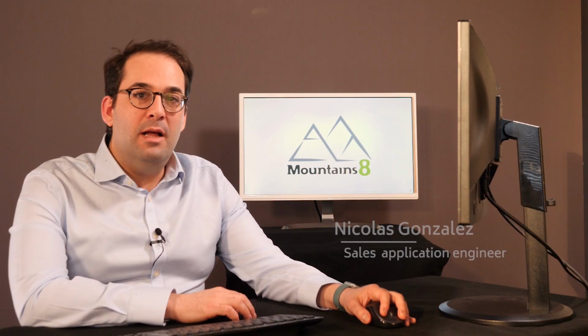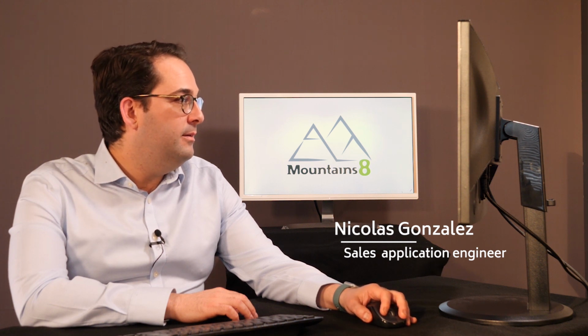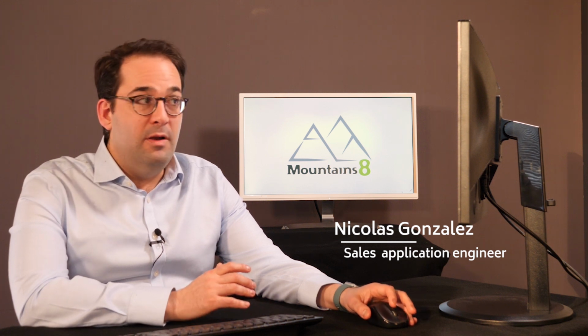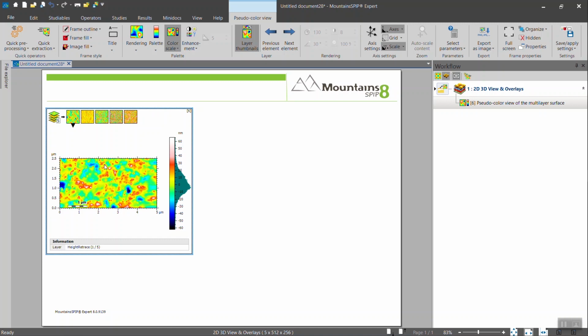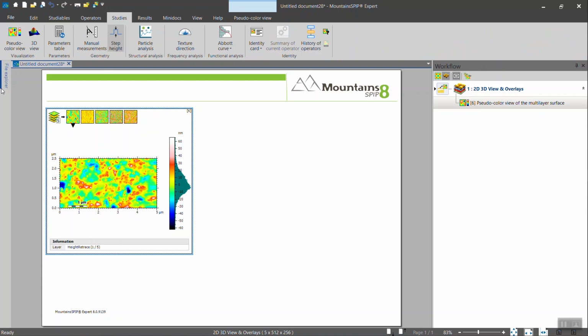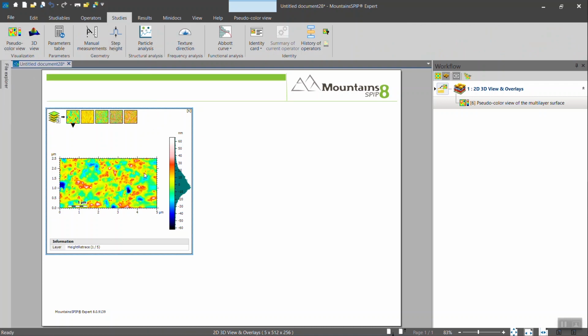So now we will start to explore the Studies tab. So let's pull some data. The first study available that you see when you import data is the 2D top view, okay, which you will also find under the Studies tab here. You can do different things with that study.